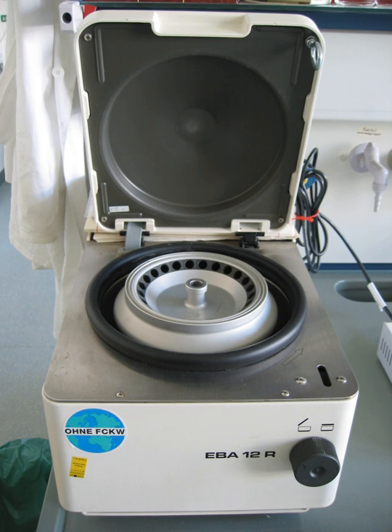Larger samples are spun using centrifuge bottles, which range in capacity from 250 to 1000 milliliters. Although some are made of heavy glass, centrifuge bottles are usually made of shatterproof plastics such as polypropylene or polycarbonate. Sealing closures may be used for added leak-proof assurance.